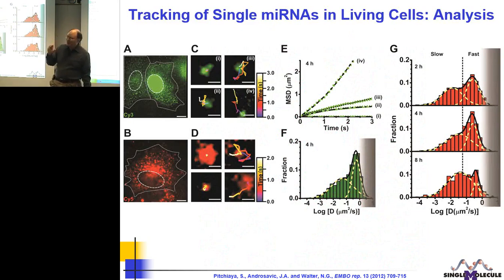So we see them disappear, okay, over time. Fewer fluorophores over time. But we believe we know now that that relates to degradation of the microRNA. The fluorophores disappear faster from the cell when there's no target there. Okay, when we use a microRNA that doesn't have any target in the cell, then they disappear faster from observation. And that suggests that this has to do with degradation of an unused microRNA. It's known that if there's no target and they're not used, then they're degraded more rapidly. And we have pretty strong evidence that this disappearance is mostly degradation, where then at some point you have a single fluorophore left and that gets exported from the cell. So we don't know. It's a very interesting question because we also work on extracellular RNAs now, but we don't have direct evidence for that.